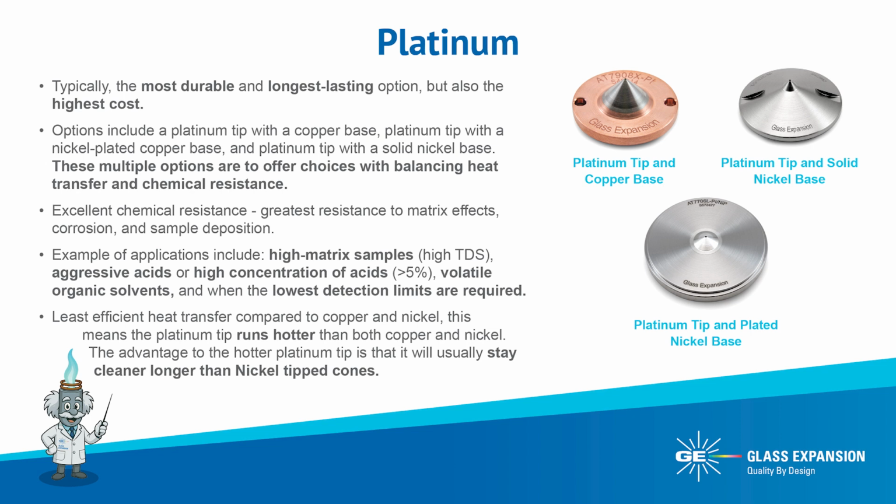Platinum has the least efficient heat transfer compared to copper and nickel, which means the platinum tip runs hotter than both copper and nickel. The advantage of having a hotter platinum tip is that it generally stays cleaner longer than nickel-tipped cones.